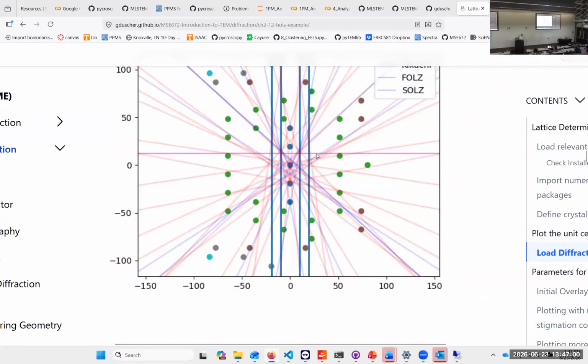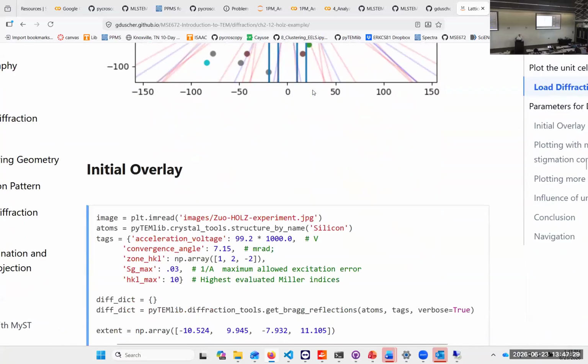The diffraction pattern is also indicated here. You notice that in such a high-index zone axis, the term Laue zone does not really make a lot of sense anymore because they kind of are combining.